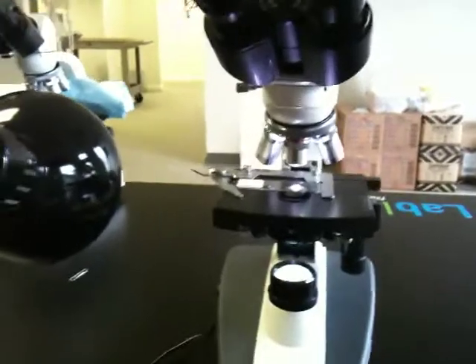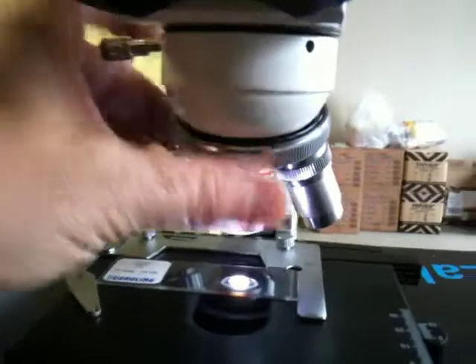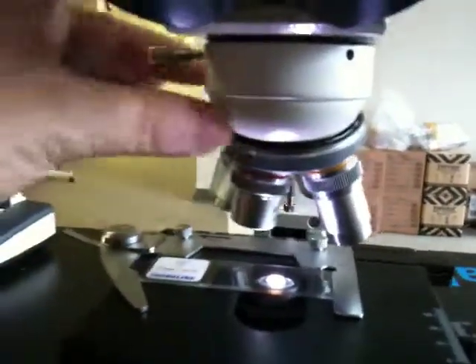And if that happens, there are a couple of things that it could be. Number one, and the most typical, is that you don't have your objective perfectly in place.